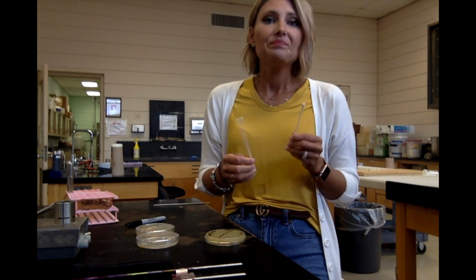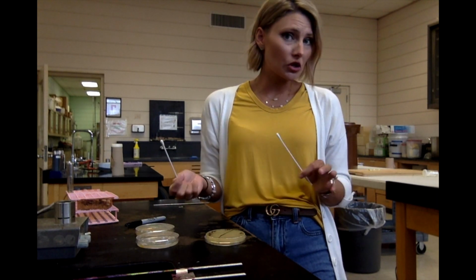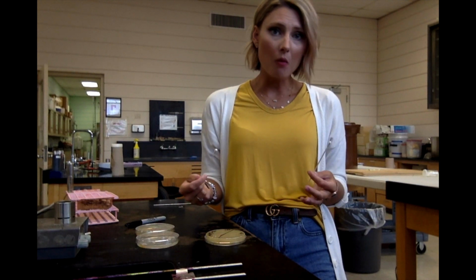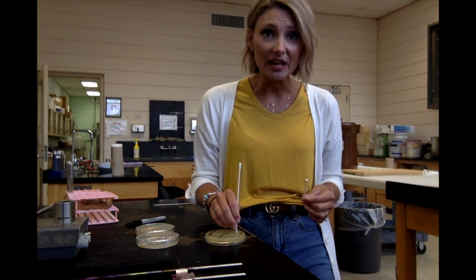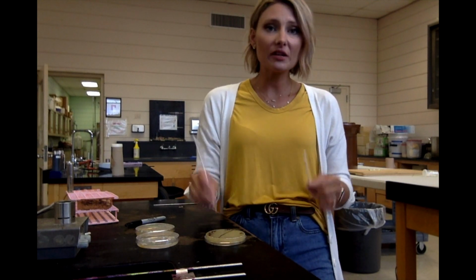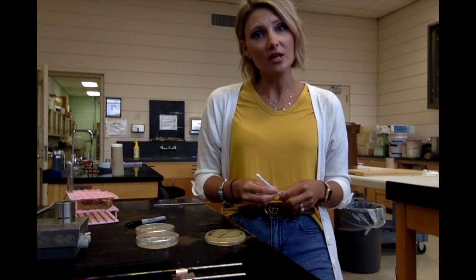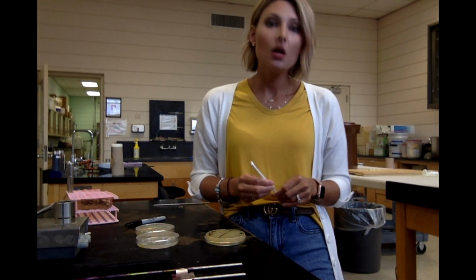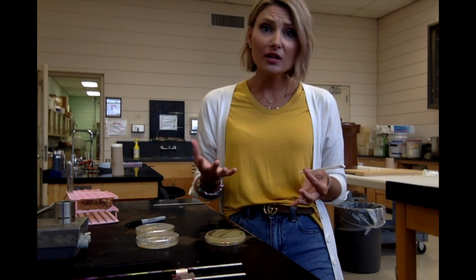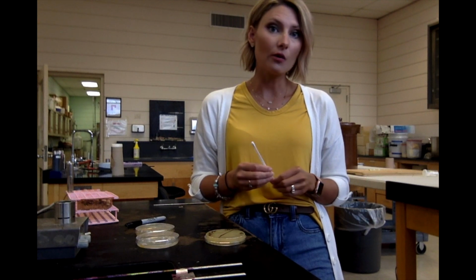Now, advice for choosing where to swab. The wetter the surface, the more bacteria you're probably going to find. Because remember, these bacteria have to be living for us to put them on the plate and for them to grow on the plate. If you pick a very dry surface, a lot of times you're not going to get any viable bacteria. Bacteria need water just like we do. So if you pick a very dry surface, you're probably not going to get a whole lot.